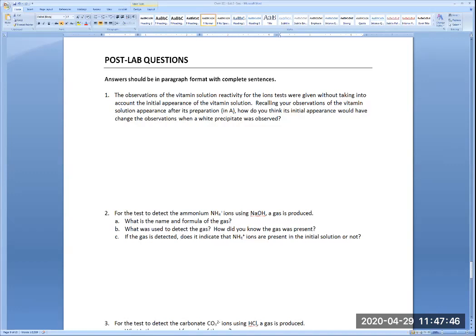I know it's not easy because that's really something you want to observe in a lab. But here, I don't have pictures of that. And so I want you to try to imagine seeing a white precipitate in a clear solution that has a color. What would you see?